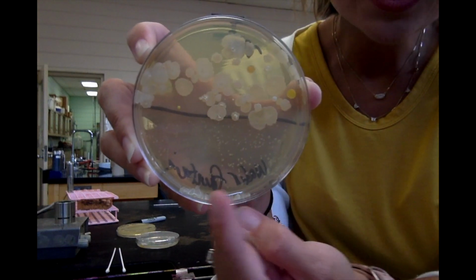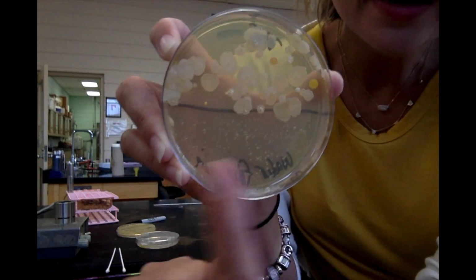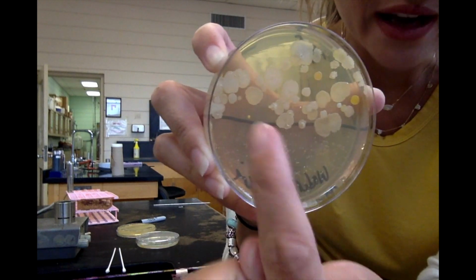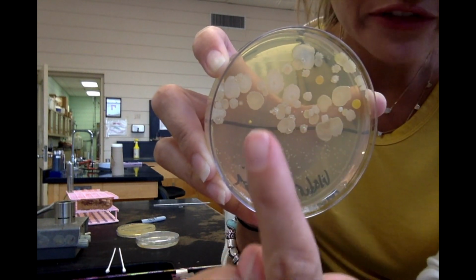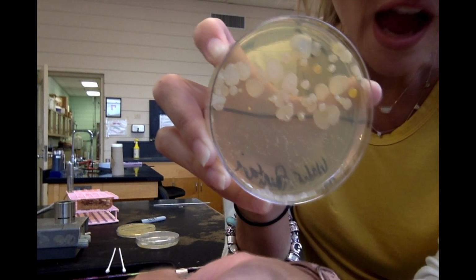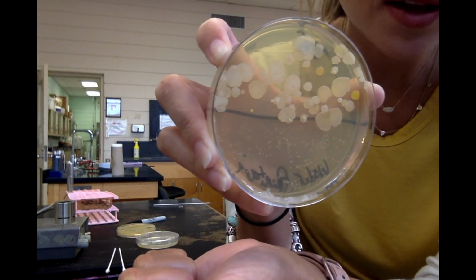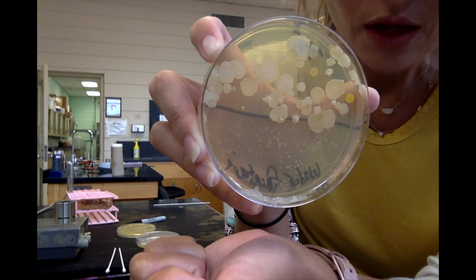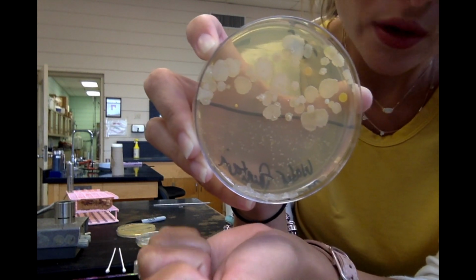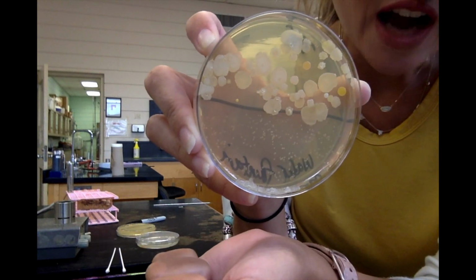The bottom is the water fountain. Now, you see that my shoe, because I'm walking outside, has lots of different kinds of bacteria. They come in all different colors, the colonies do. Some are perfectly round, some have some weird edges to them. We've got some yellow ones, some orange ones, some white ones, some more colorless looking ones. So each one of those is a different kind of bacteria.